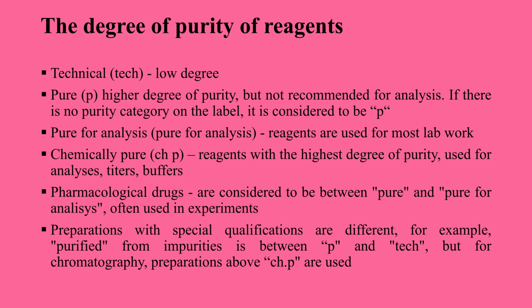The lowest degree of purity of reagents is technical, like what is used for cleaning something. Pure chemicals are a higher degree, but not used in analysis, only pure. But pure for analysis has special markings. These are typical chemicals that we use in the laboratory.